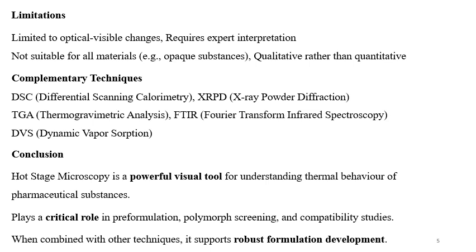Complementary techniques: DSC, that is differential scanning calorimetry. These are the complementary techniques for HSM: XRD, TGA, FTIR, and DVS. So along with HSM, if complementary techniques are used, then it will be advantageous to have the particular data and interpretation for the study.